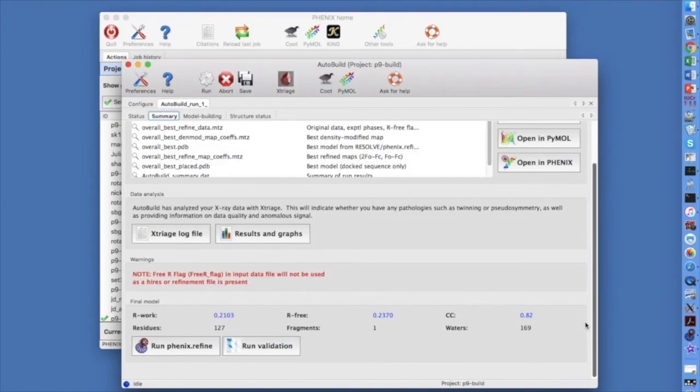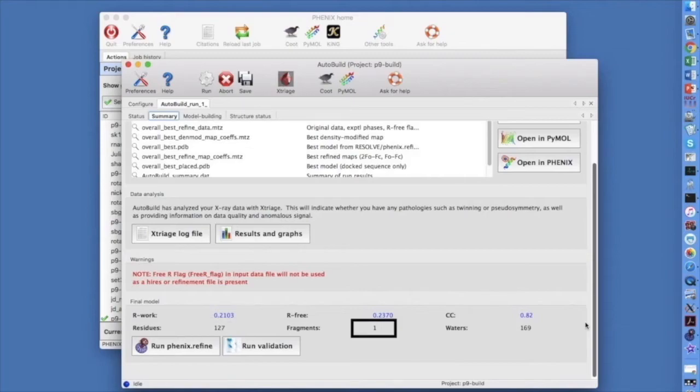The Summary tab shows the files produced and the overall statistics for the run. This model was built with 2.5 Angstrom data. Notice the FreeR value, the number of residues built, and the number of fragments making up the model. At this resolution, a FreeR in the 20s or low 30s and most of the model built in fragments that are about 50 residues or more in length is just fine.